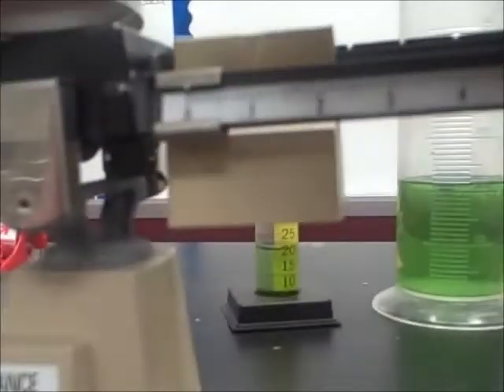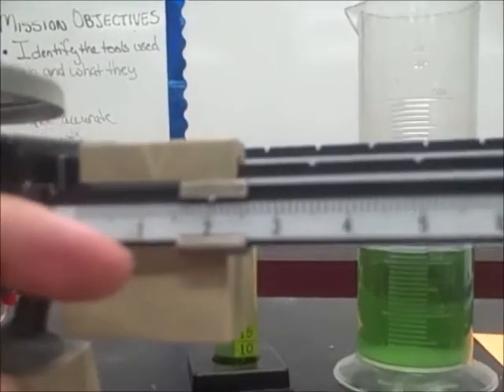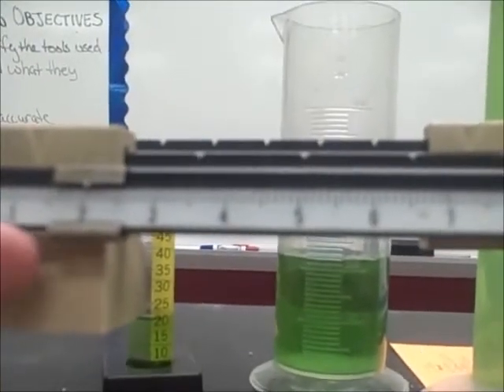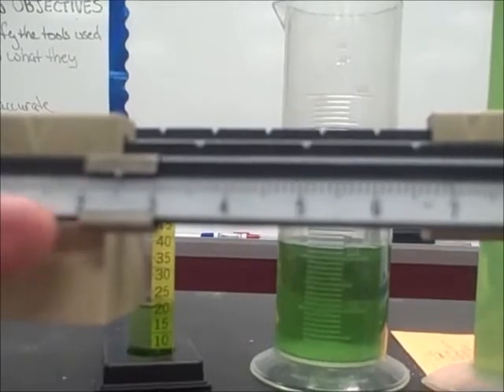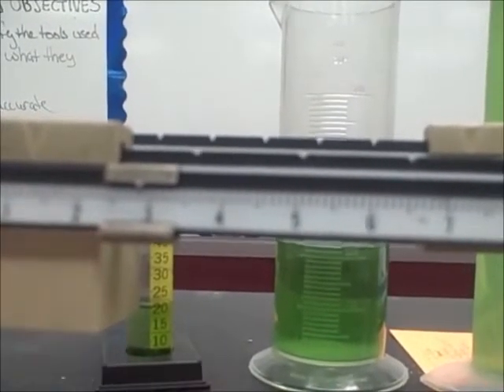Now we go to our last beam and we'll move this over slowly until our lines meet up. If we take a look at our lines right now, it's still a little too heavy, so I'm going to move this rider back until that line comes back up and is in line with the zero.